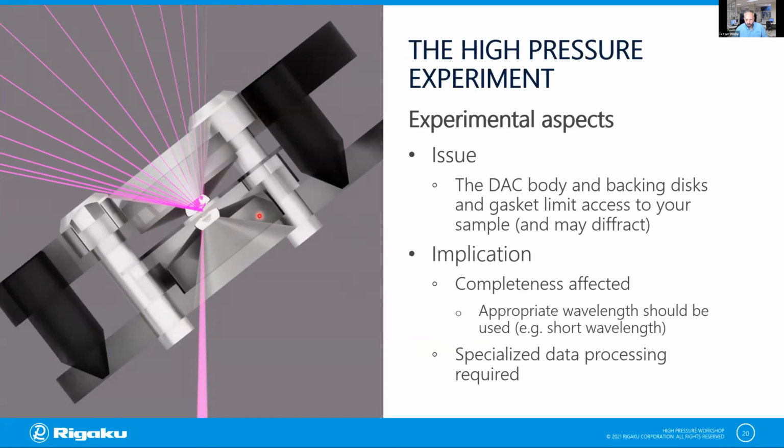And depending on the cell you're using, you might have something like an 80-degree opening angle. So that's this total angle shown here, over which you'll be able to rotate the cell around like this and still see diffraction from the crystal.